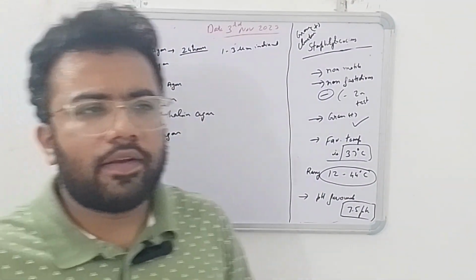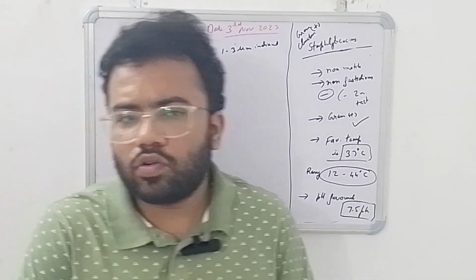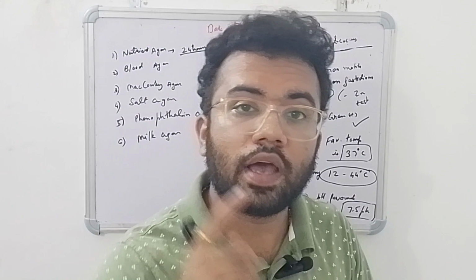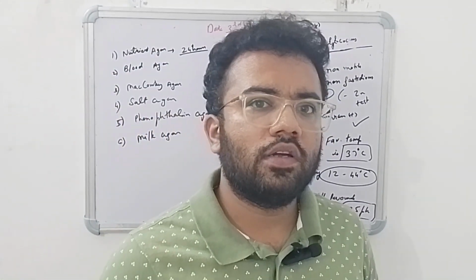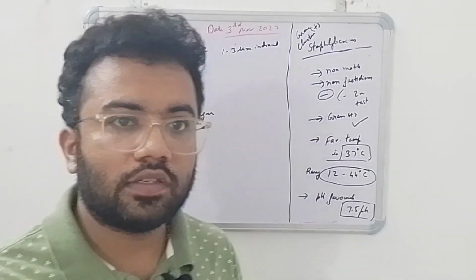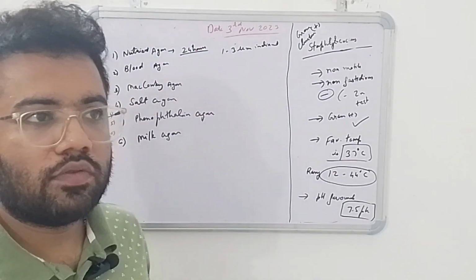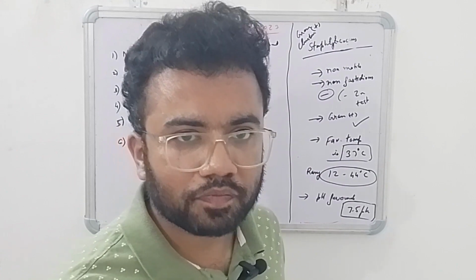See, this bacteria is aerobic and also non-aerobic, so it works in aerobic condition, also in anaerobic condition. But the main thing to remember is that this bacteria produces more pigmentation in the aerobic condition, not in anaerobic condition. It can be incubated in anaerobic condition also, but the aerobic condition, meaning the oxygen dependent condition, produces more pigment. So on nutrition agar, if you have aerobic incubation, the pigmentation will be enhanced more, okay.